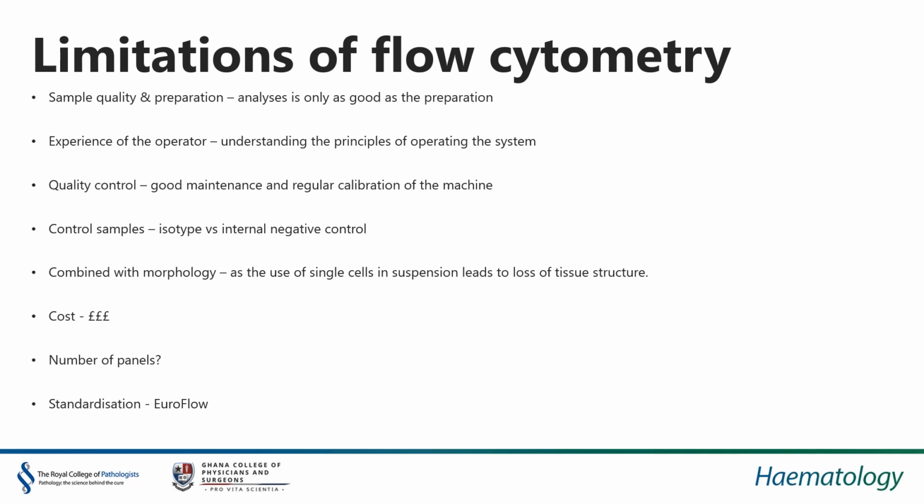Flow cytometry has to have quite experienced operators who actually have to understand the principles of not only operating the system, but actually having a good understanding of the biology of the disease. You need to have good quality control, good quality maintenance. And then there's this argument of whether you should be using control samples to set your gates, or do you use internal biological negative controls?